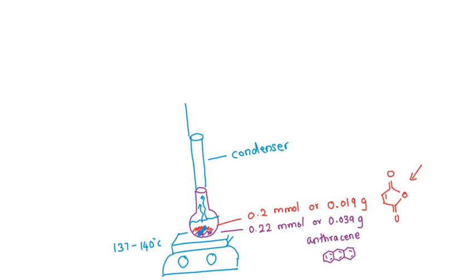Okay, condenser. And because this reaction is moisture sensitive or humidity sensitive, we need to put some drying agent on the top. The simple way of avoiding atmospheric moisture getting in is to put a stopper on the top. It's very simple, right? But what is the problem here?